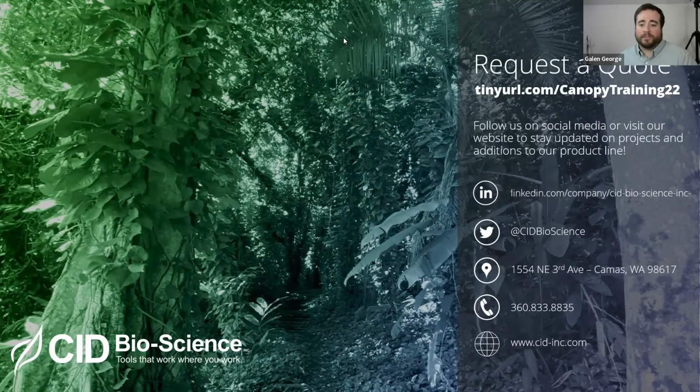Once you start messing with the assumptions made within the calculations of these methods, that's when you can start seeing changes in accuracy. I highly recommend checking out that webinar for more in-depth information on uses of this instrument in orchard settings.